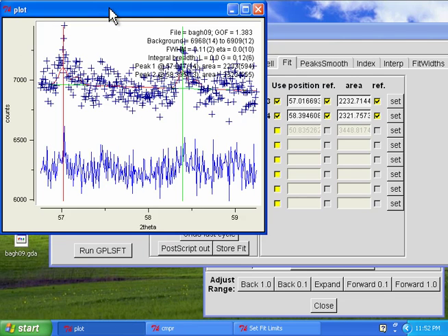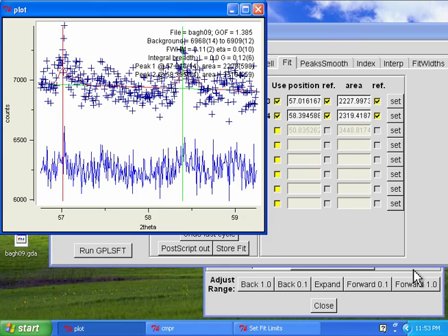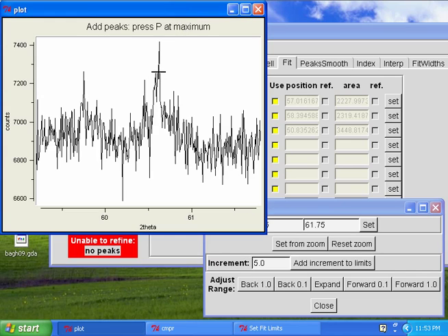And it's not quite converging, but there's a hint of another peak here, but I don't love these peaks. Again, might be a place to make a note that these are not particularly intense peaks, and it's not converging well. Alright, we're almost at the 60 degrees I said we wanted to go to, so let's go a little further forward. And okay, that's certainly a peak there.